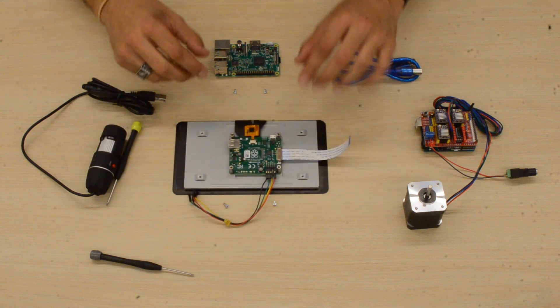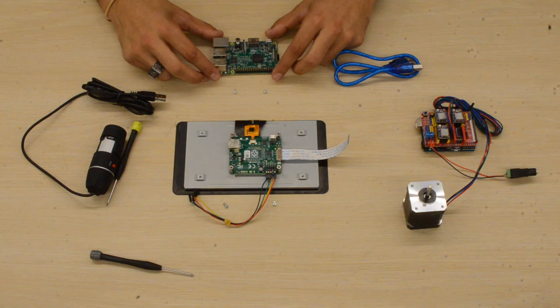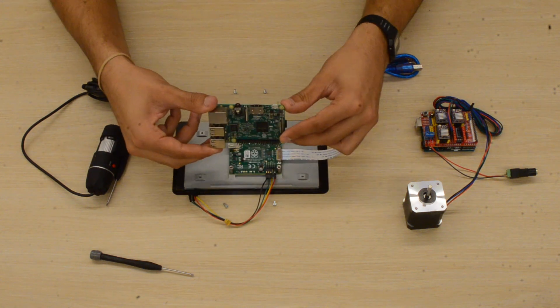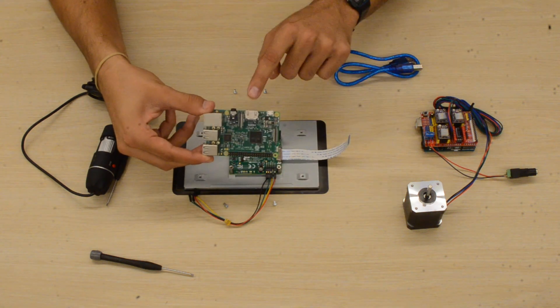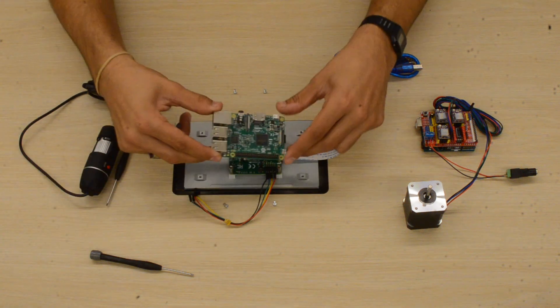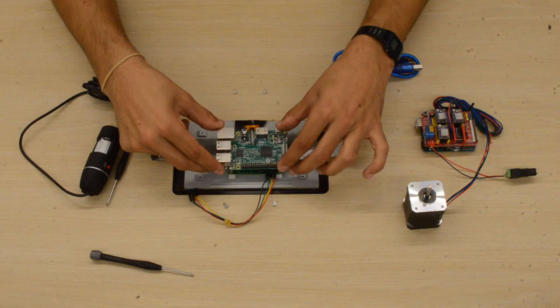Next, we'll grab our Raspberry Pi, place it on top aligning the screw holes, and we'll make sure that the HDMI port aligns with that cable at the bottom.